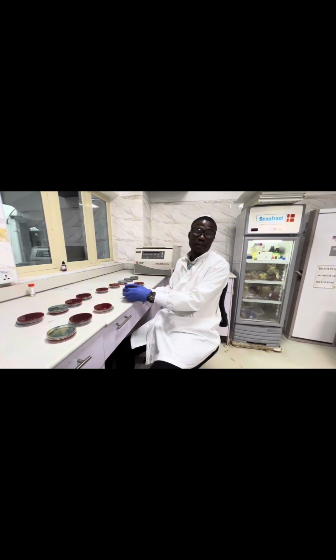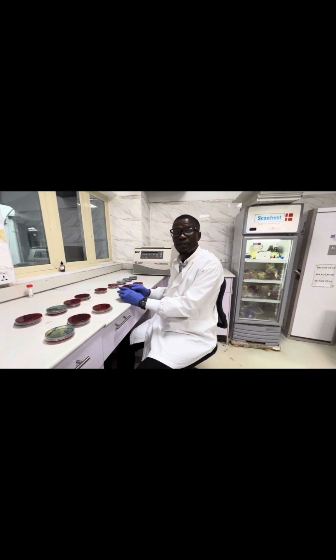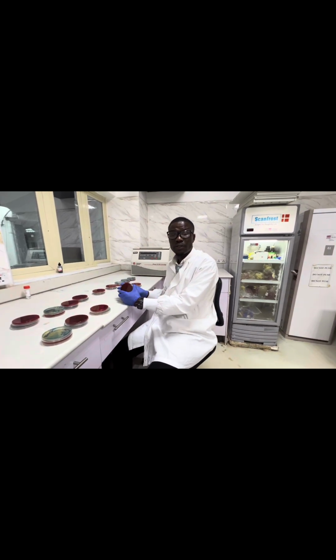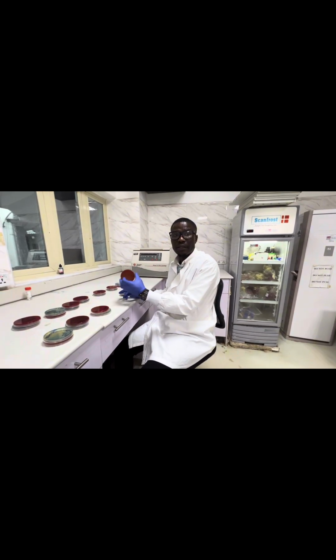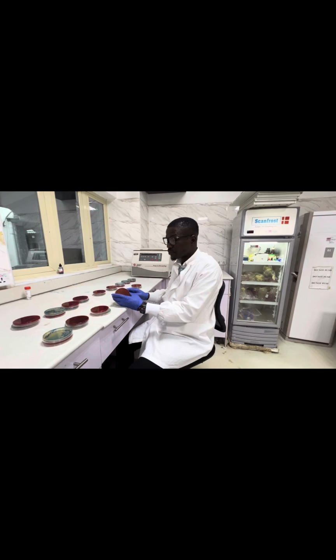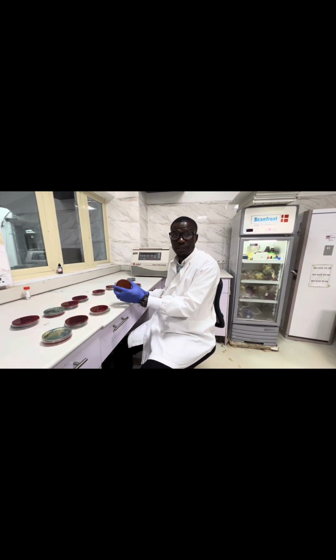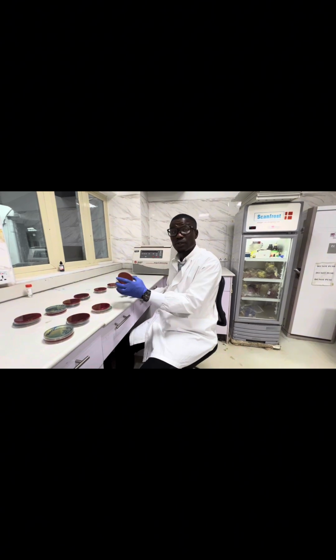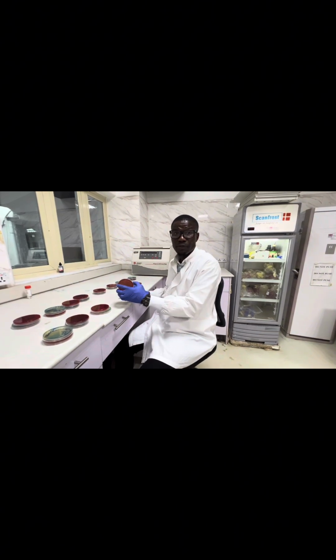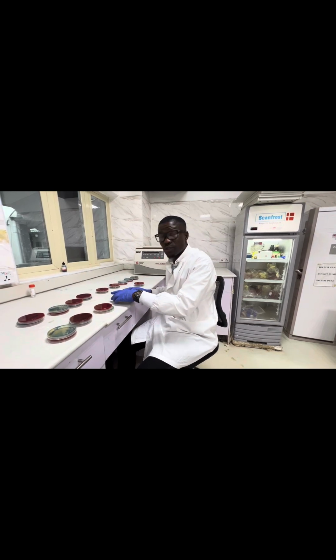Those are how to describe your colonial morphology. After doing colonial morphology, you send for biochemical and sensitivity, which is antimicrobial susceptibility testing. I believe in my other video, I'm going to also do that using CLSI standard.